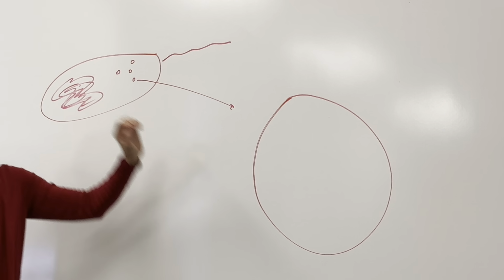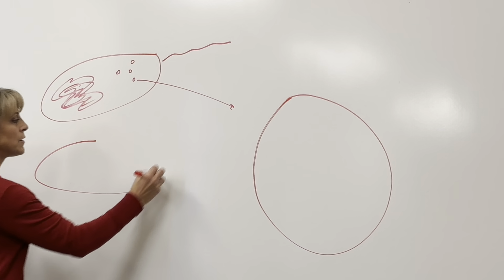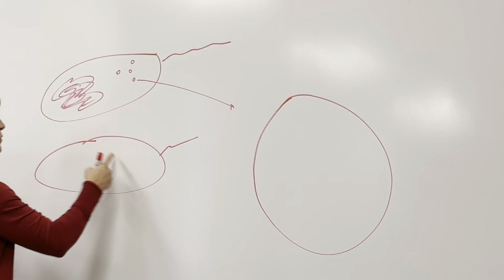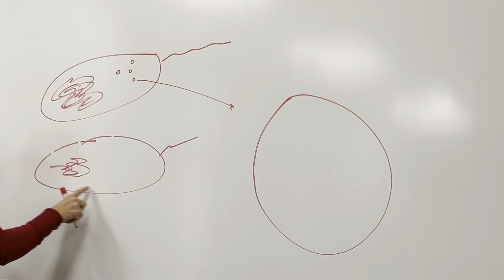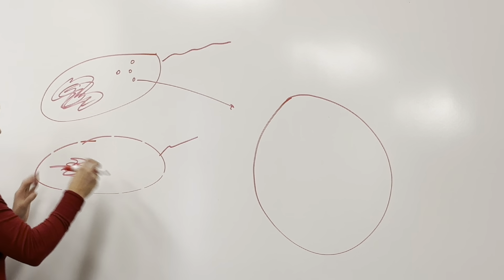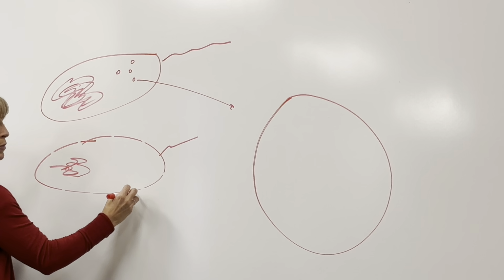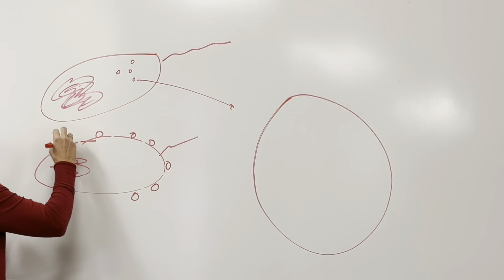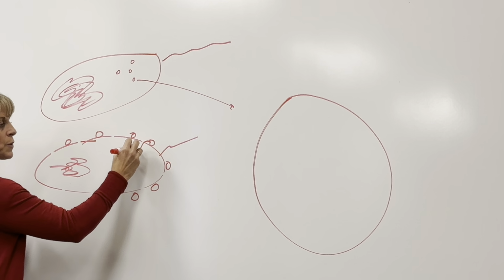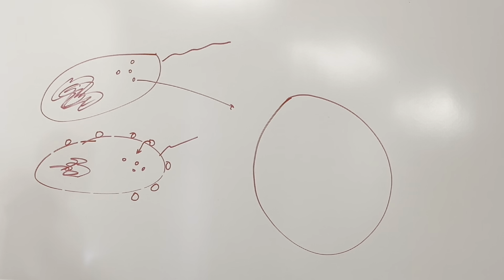But we're going to induce competency. To induce competency in our non-plasmid owning E. coli, we heat shocked. So we made pores, we melted that outer membrane, and then we put plasmids in the soup, in the Eppendorf tubes, and those plasmids were able to get into the bacteria. Some of them worked, some of them didn't work. Some of them died, some of them didn't die.